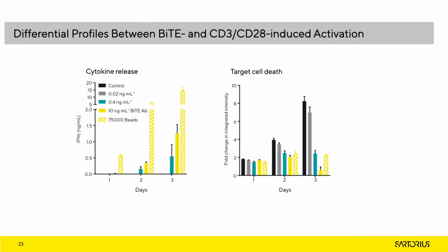Again, from the same assay plate, cytokine samples were taken every 24 hours during the 3-day assay and analysed using the iQue. A concentration-dependent increase in the release of interferon gamma in response to BiTE stimulation was observed, as well as a concentration-dependent decrease in target cell numbers.